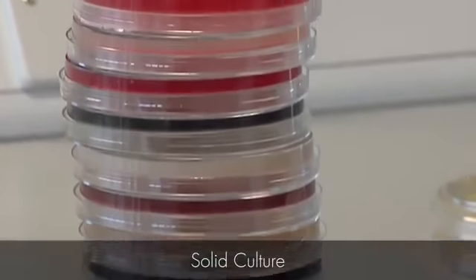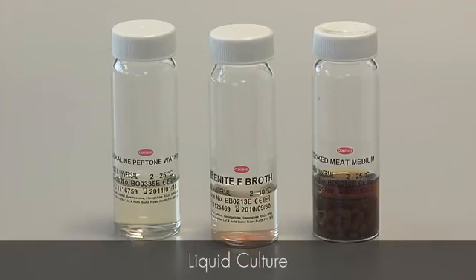So, a sample from a patient is placed onto, the term is inoculated, onto culture media to determine if any organisms are present, and if they are present, what they are and how many there are. The two main types of media used are solid media and liquid culture.